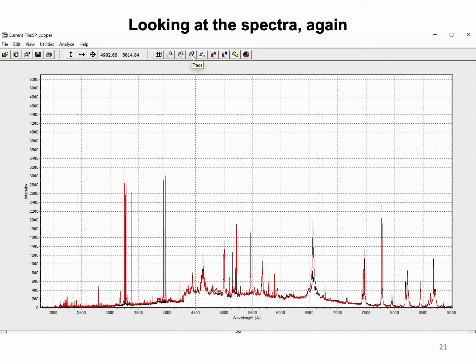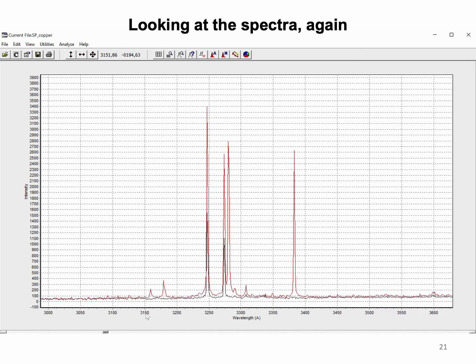However, our system is not perfectly suitable for this application because the maximum spot diameter is approximately 300 microns, and instead, a larger spot size should be preferable for LIBS. However, for the copper lines, the enhancement factor is around 2, depending on the specific line.